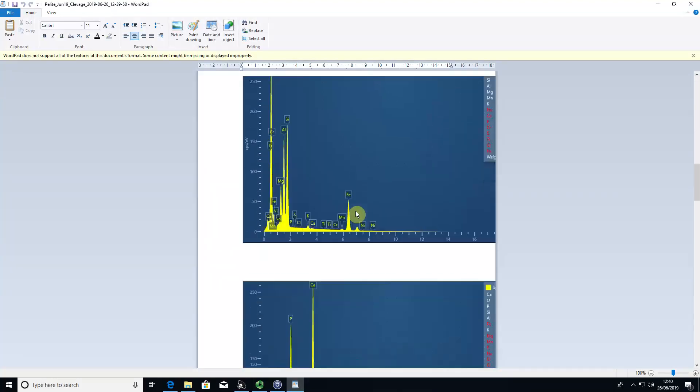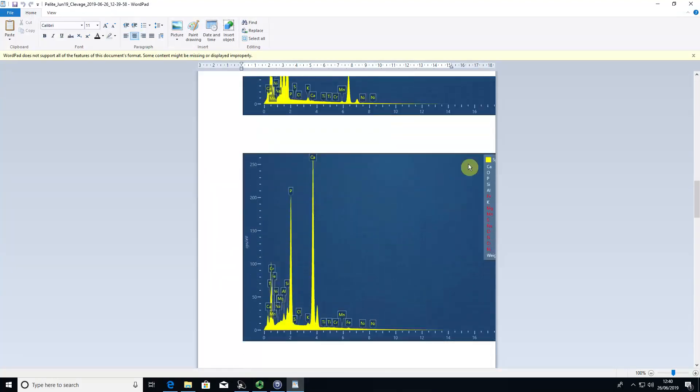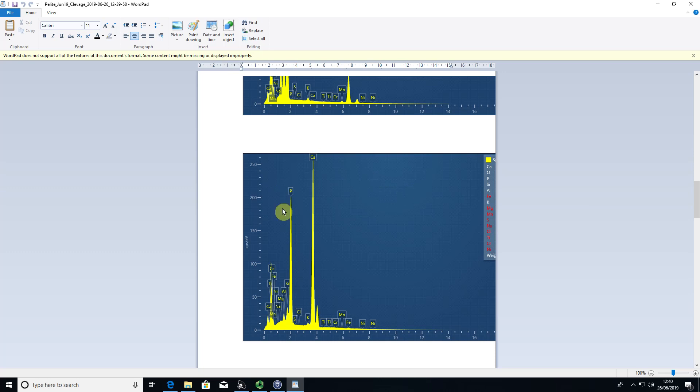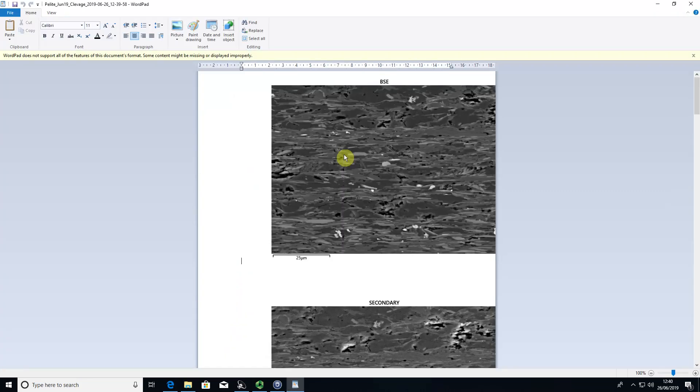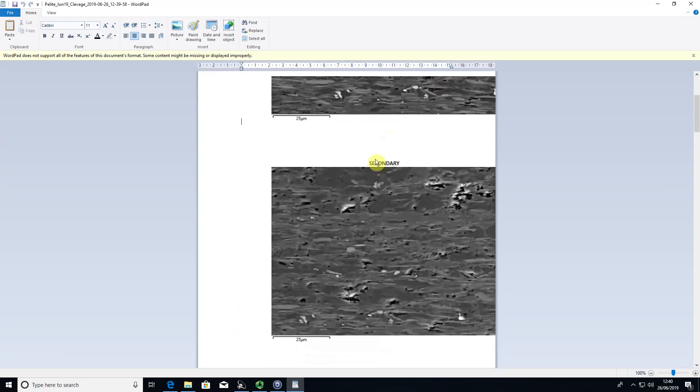It's cropped the spectra. In this case, that's a Word issue on this computer. On the processing computer in the lab, that's not a problem. So you can actually see what the spectrum number is, and then you can relate that back to your backscatter electron image.